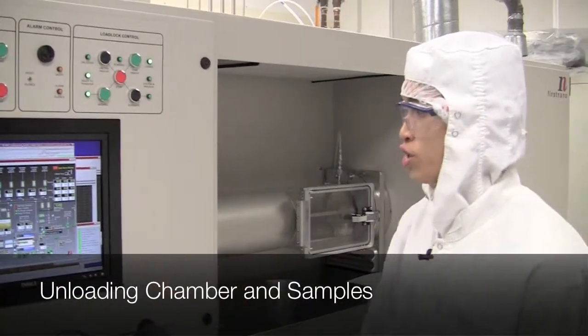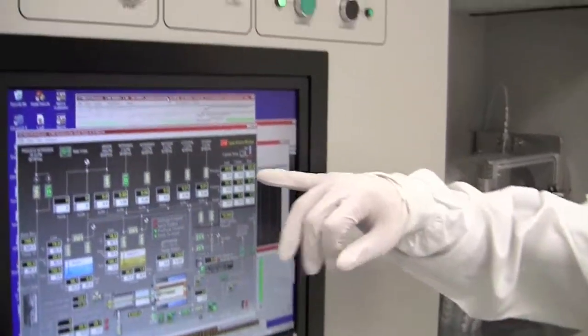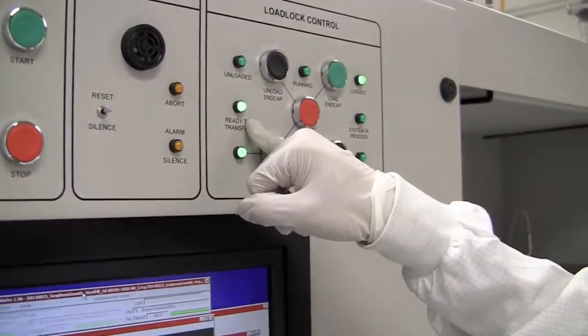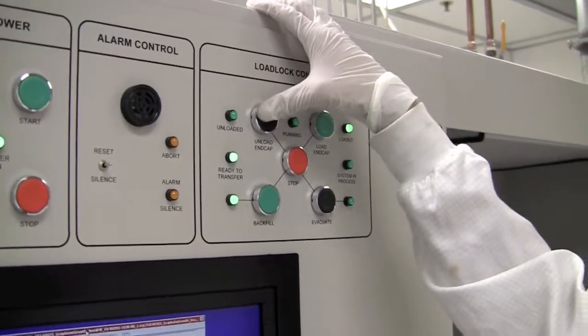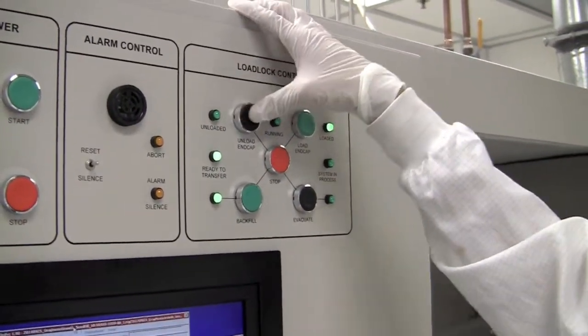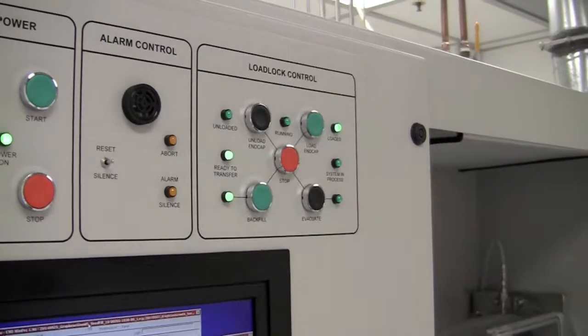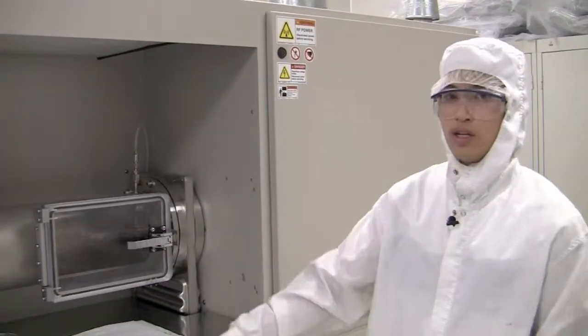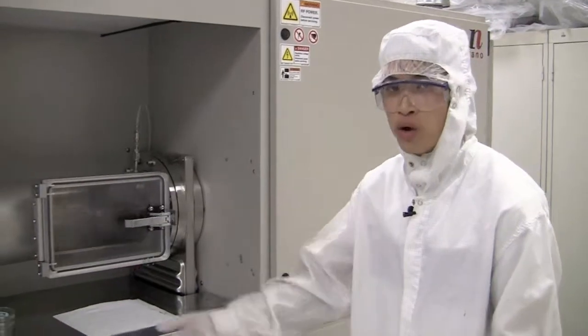Now the growth chamber is back to atmospheric pressure. We can see the ready to transfer light is solid green. That means we can go ahead and on the load lock control, hit unload end cap. This will remove the loading arm back to the loading chamber. Now that the loading arm is unloaded, it's no longer in the growth chamber, it's back in the loading chamber. We can remove our samples.